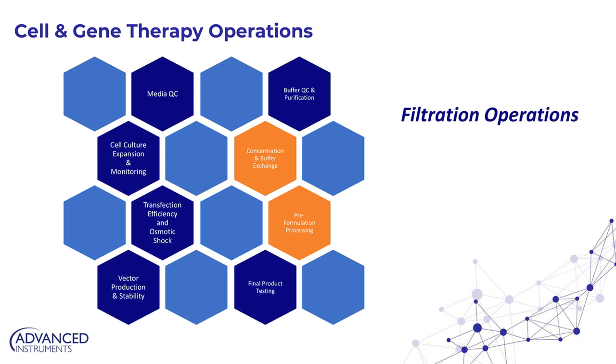So if we go back to cell and gene therapy specifically, the last piece that I'll discuss in downstream operations would be filtration.